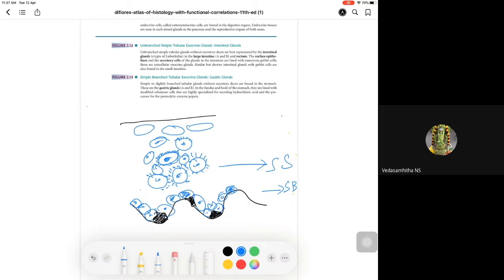And if you go above, there are some cells that are more flattened, more maturing. They will have a nucleus, and they will have blue or pink granules in them. So what is this layer? Stratum granulosum. Go above, there will be some very flattened cells. They won't have that many nuclei and they will be full of keratin. Stratum corneum. Now what are the layers? Tell me.